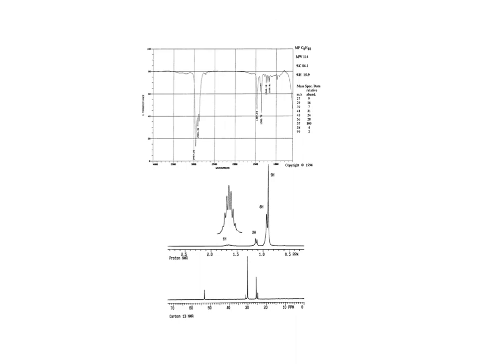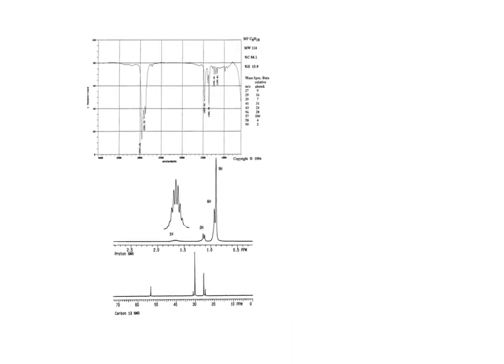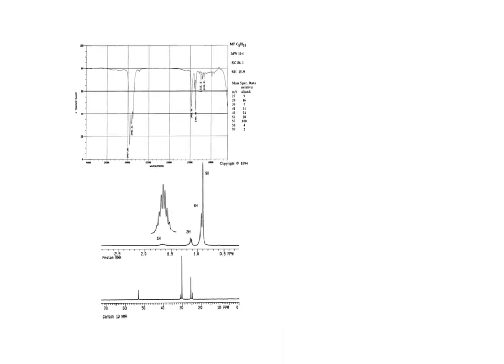So I give you overall 8 different structures that have their IR spectrum, that have the NMR spectrum to analyze. And I want you to take all of that data and tell me what the overall structure of the compound is, okay? So with the first structure, I'm going to walk you through this. I'm going to tell you exactly what I'm expecting for each one, and I'm also going to try to explain what you're seeing in each of these individual spectral data, okay?